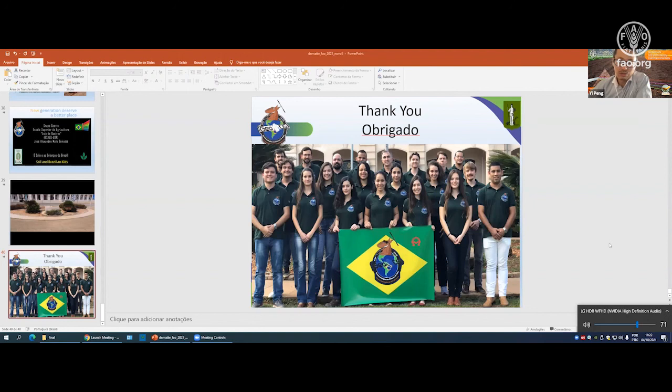First of all, I would like to respond a little bit to this colleague and also other colleagues. There are quite many free open data resources, spectral libraries, in this world, such as the LUCAS data, which is a European soil spectral library. It's freely available for everyone to download and use. And currently GLOSOLAN is working with different partners, and we are trying to build a global library with existing data, and also trying to invite different partners to share some of their information to build a better and bigger global spectral library. And we aim to provide a free online estimation service as well.